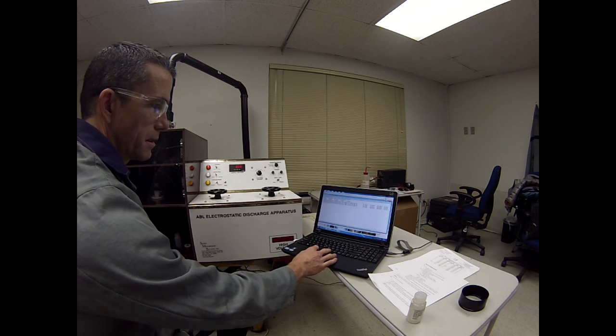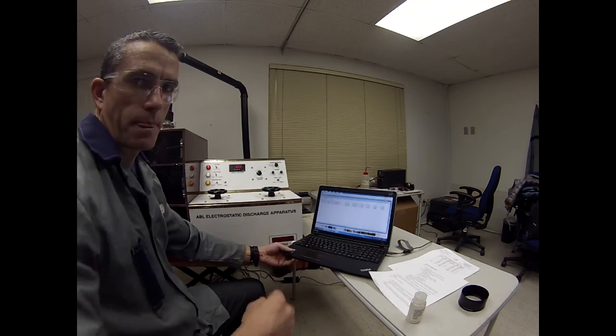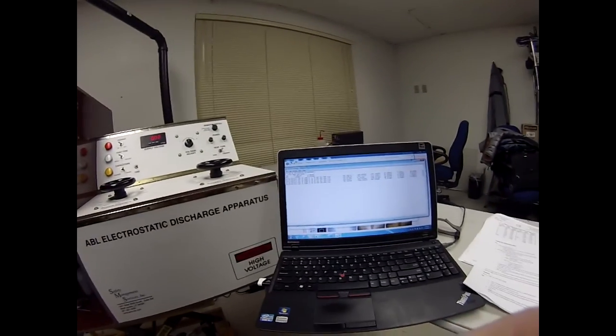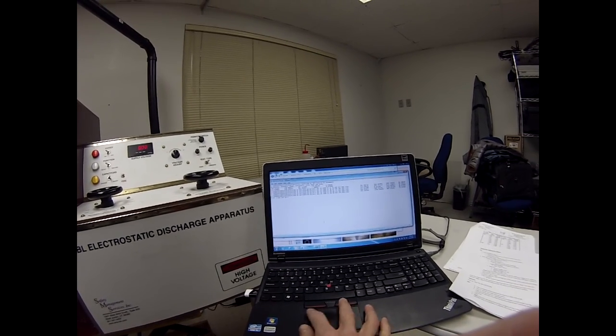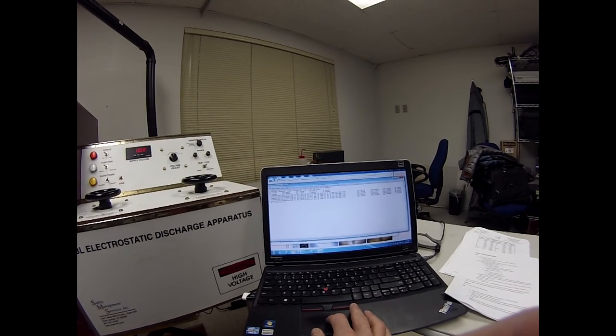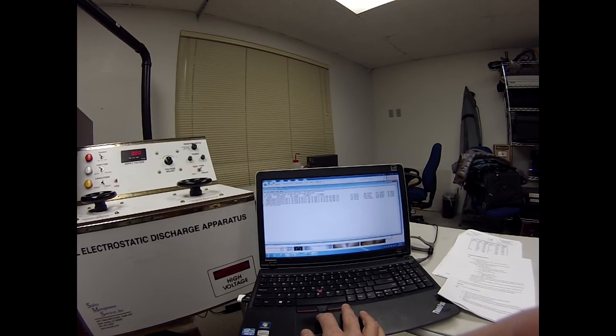And there's the brightness and buoyancy, shape, uniformity values, and the trial values. You can see here that the brightness values are around 400. Those are similar to what was shown here. The buoyancy was 330.